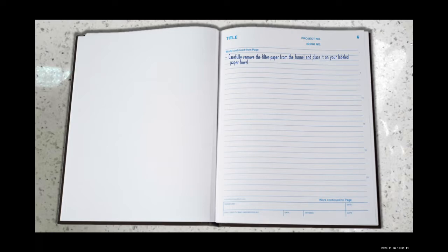Carefully remove the filter paper from the funnel and place it in your labeled paper towel.